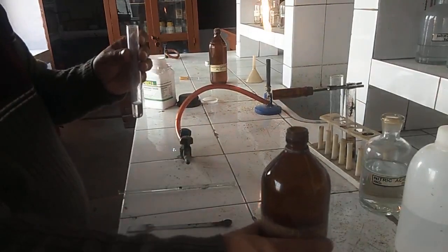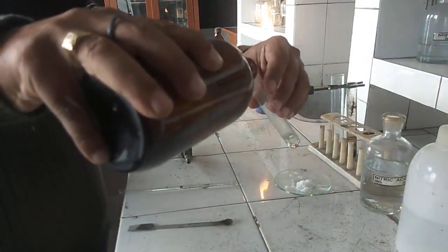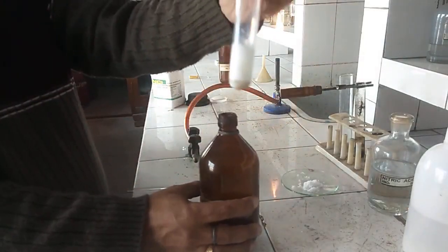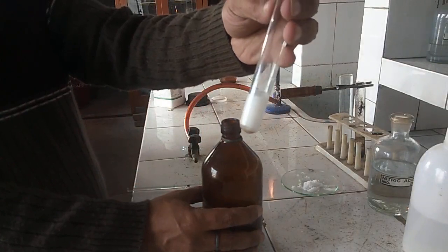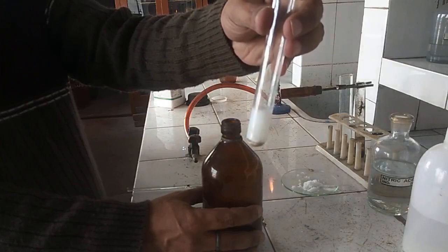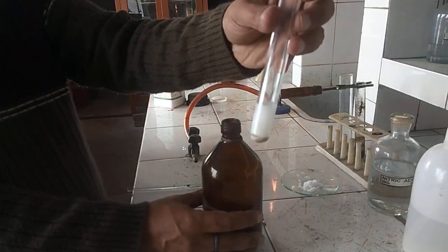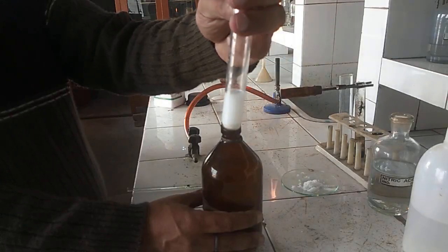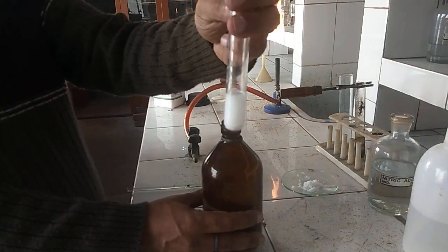Now we will add silver nitrate solution to the test tube. The formation of a white precipitate confirms the presence of chloride ion. Basically, silver ions from silver nitrate solution react with chloride ions and give a white precipitate of AgCl. See, this beautiful white precipitate is of AgCl. So this is another confirmatory test for chloride ions.